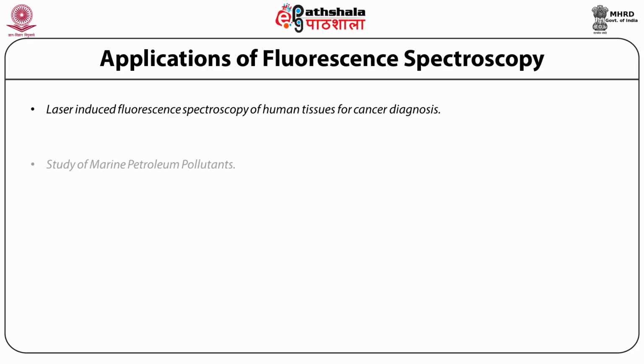Second, the study of marine petroleum pollutants. Here, fluorescence spectroscopy is used to determine oil slicks on the water surface and determination of petroleum contaminants in seawater, as well as determination of particular petroleum derivative compounds and identification of pollution sources.